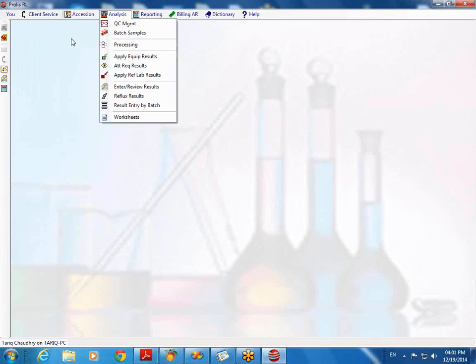The software is huge, but I'm going to show you the part you are interested in. So would you like to tell me what part you want to see, which I should start talking on? Right. So our primary interest is to acquire software that can help us with accessioning, so the shipping and receiving of samples. Okay, that's fine.